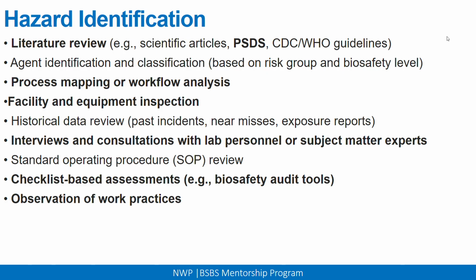Through that, you'll be able to tell that people using this biosafety cabinet have an increased likelihood of being exposed to what they are working on because they are not using it correctly. Therefore, the practices you have observed will tell you something about where the likelihood and consequence will fall.